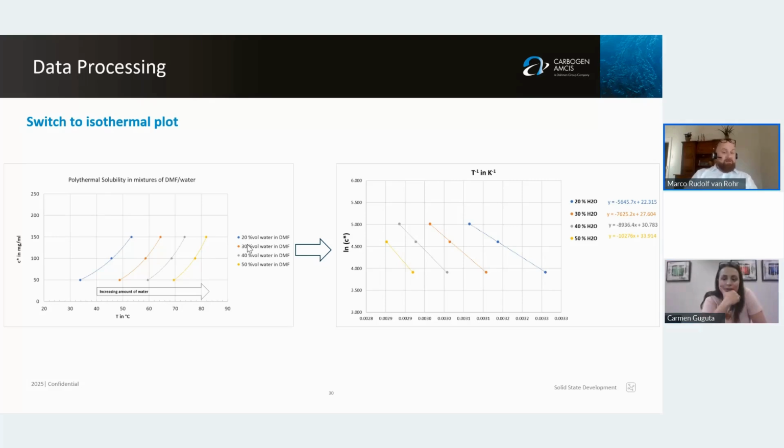So, do I have experience detecting films and coatings? Not really. If we see that we need to put in more energy, we use the steel hooks. But often for this kind of investigation, the solubility data is more important for me than nucleation data.